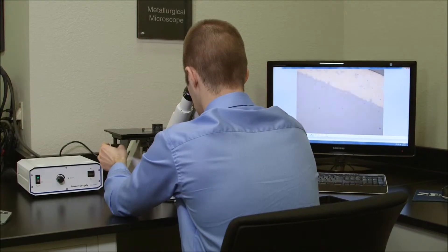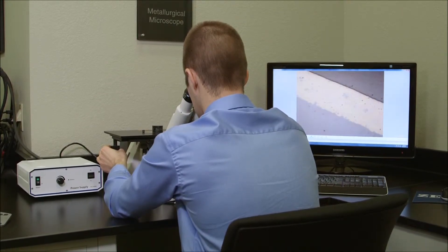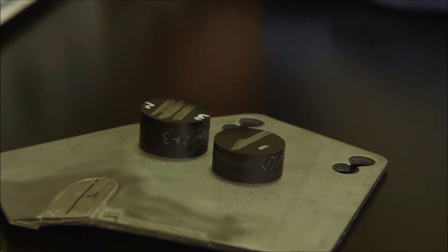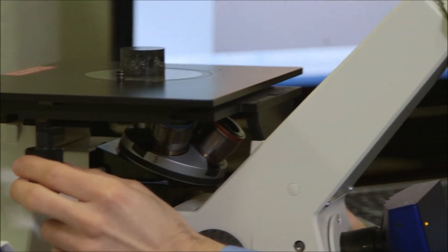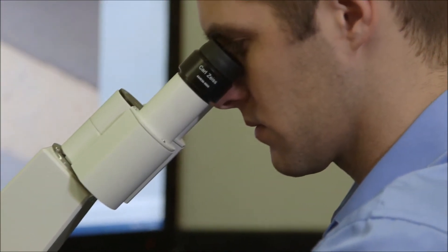Another very important part of metallurgical analysis is the analysis that we do on microstructures. In order to do this, we use a Zeiss Axiovert 40 microscope that's used to look at mounted and polished specimens. In our mechanical testing room, we can prepare specimens to a mirror finish, etch them, and then look at the revealing microstructure underneath our inverted metallograph microscope.